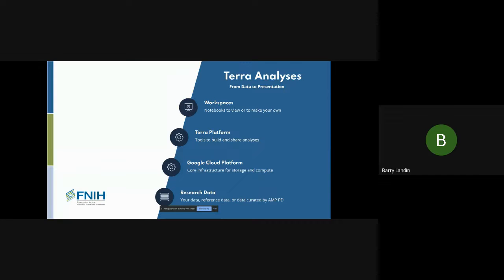One thing we're improving, probably in the next couple of months, is to put an annotated catalog of all the notebooks and workflows that are part of these resources on the public site, so that you can see them, click into them, and have that take you directly. But that catalog is coming soon. The resources are there today, but you would need to go into Terra and see the workspaces in a flat listing.